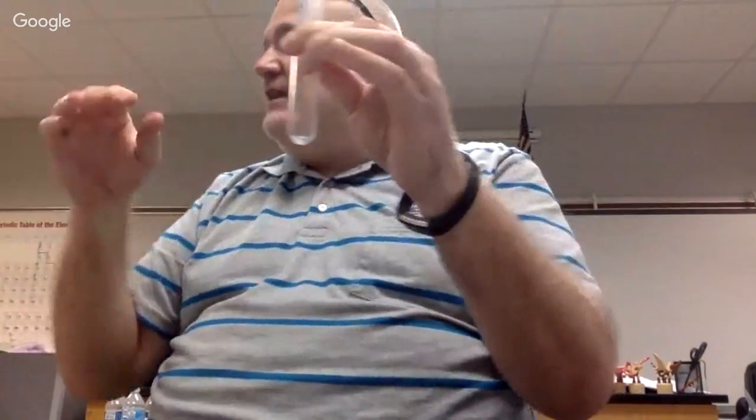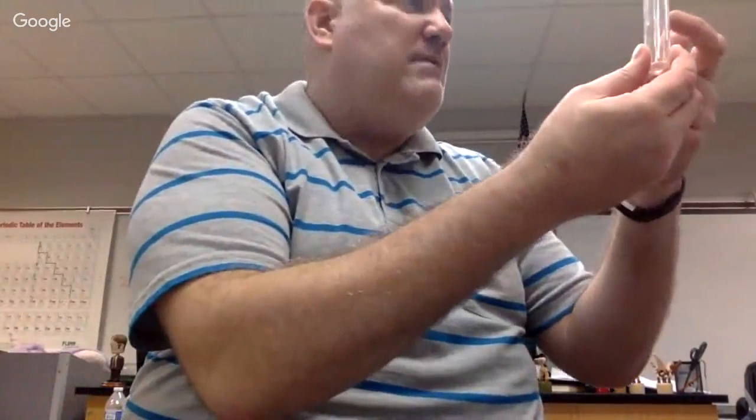So what you should do then is, and this has happened in almost every class, I've had 2 or 3 groups say, but there's still stuff on the bottom, and I put so much in here. Take a stirring rod and stir it in, and almost immediately it'll all dissolve. What's happened is that the particles on the bottom haven't been accessed by the hydrochloric acid. Now, you're safe to move on to the next step when there is no solid left in here. It may be colored, it may be not colored, but there's no solid in there. Can I get a head bob on that?